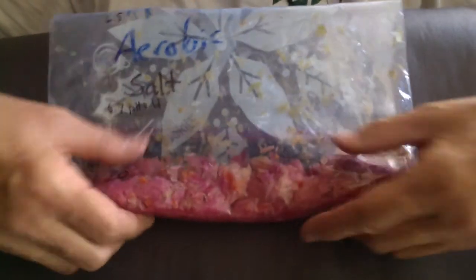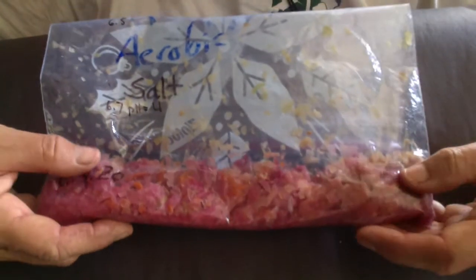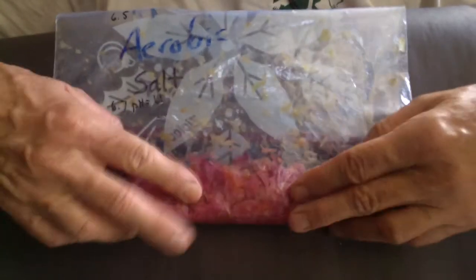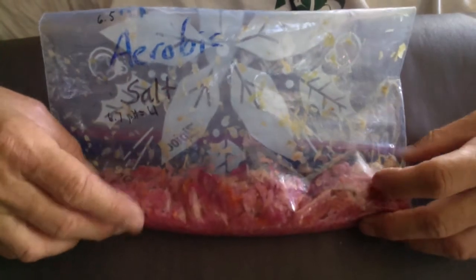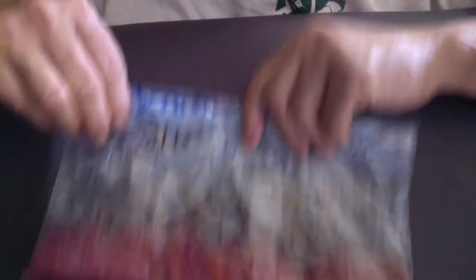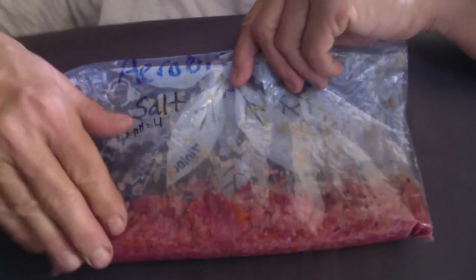Next we have our aerobic with salt. You can see the salt creating the hyperosmotic environment — we get a net movement of fluid from inside the plant cells to outside. That created a liquid environment that was probably at least a little bit anaerobic down at the bottom. So you can see it's not rotting as much. Maybe the cabbage up at the top where air was present is starting to look oxidized and kind of rotten. If I take a big whiff — that smells like sauerkraut. It has that really nice lactic acid aroma. So that's our aerobic cabbage plus salt.